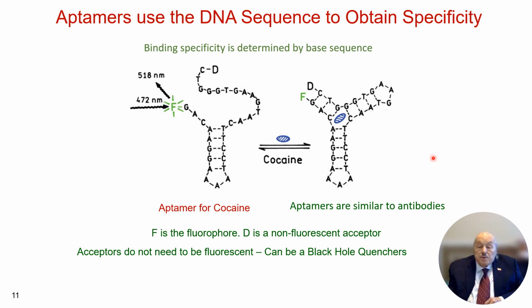Switching again to another type of probe, and these are, I think, getting increasingly interesting. These are the aptamer probes. Aptamers, in a way, behave like antibodies, but they're typically made out of DNA strands, and the sequence is chosen so that the strand is partially self-complementary, but it doesn't become completely bound to the complementary parts until a particular molecule is available.